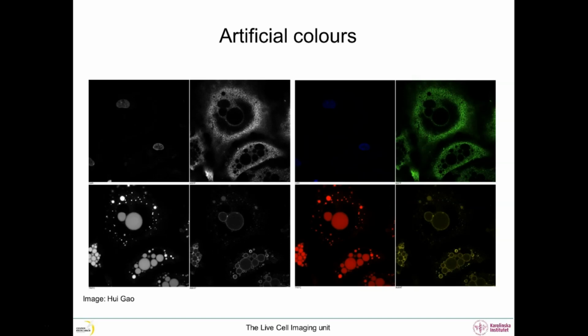Often the photons coming from one fluorophore show up in the image of another one, and this is not detectable in the black and white image. This condition is called bleed-through and can lead to dramatic interpretation errors. To explain how we image multicolored samples using black and white detectors, we will start with the example of a wide field microscope, then show that the same principles with minor changes apply to confocal microscopes.